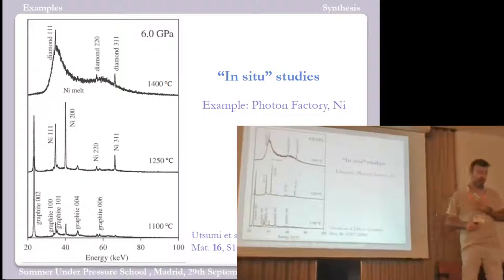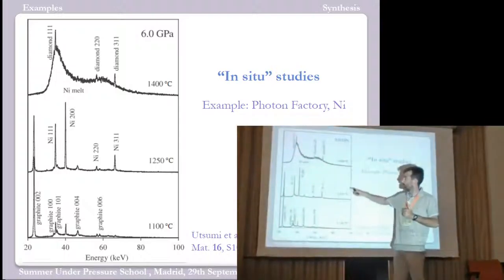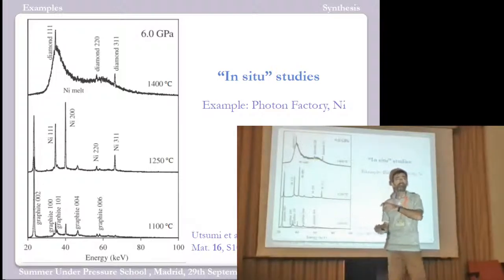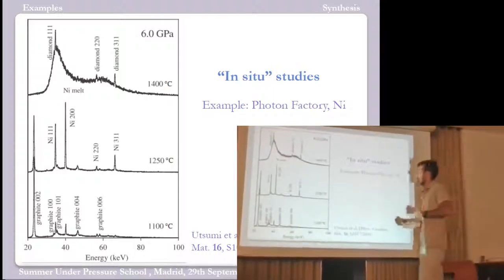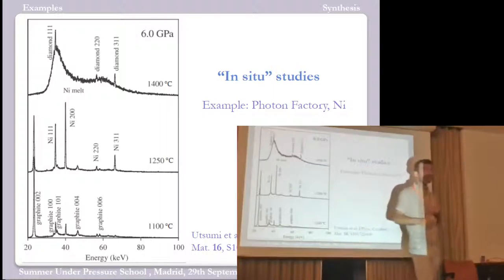So we have a lot of information from this experiment. First, you don't have any reaction at 6 GPa at these temperatures. I mean, you don't have any reaction between the sample and the container or whatever. But you have your sample formation at this precise temperature.